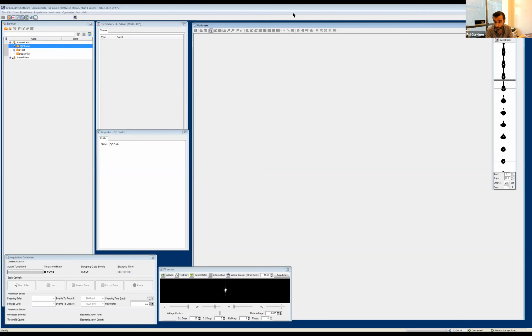Oh, it's an RS3 they're mentioning. So yeah, we don't adjust the phase here on the ARIA. Did you mention that, Kathy? No, I was just going to bring up that, from what I remember on the Astrios, and on the MoFlo, we would adjust the charge phase based on the fanning. We would go to the middle of the two points where the fanning was the worst, set it in the center of that, and subtract 180. So that's what we would do on that instrument.